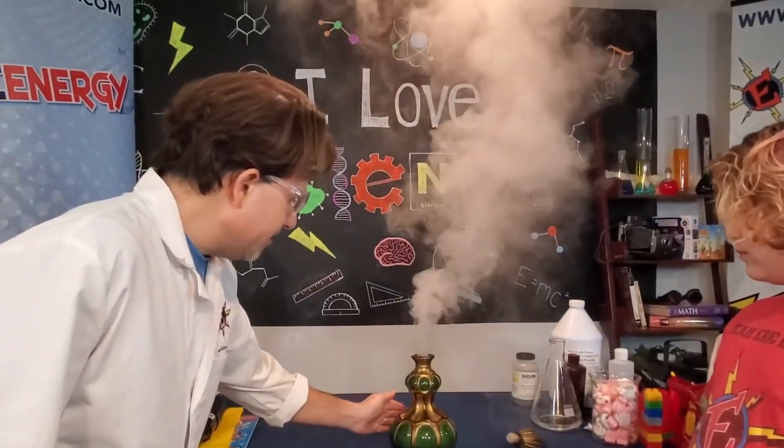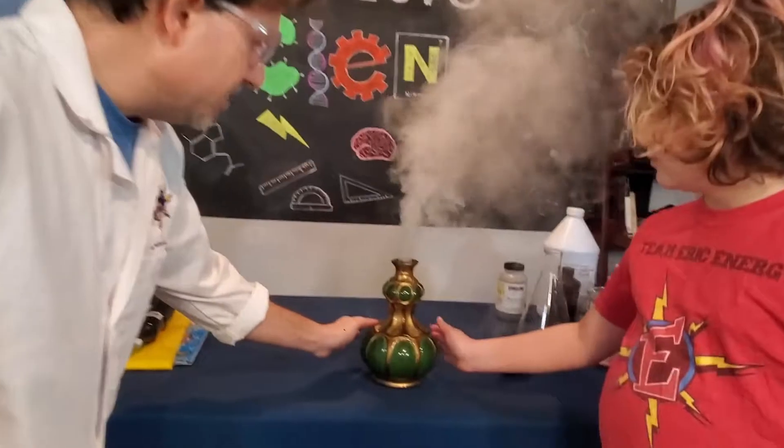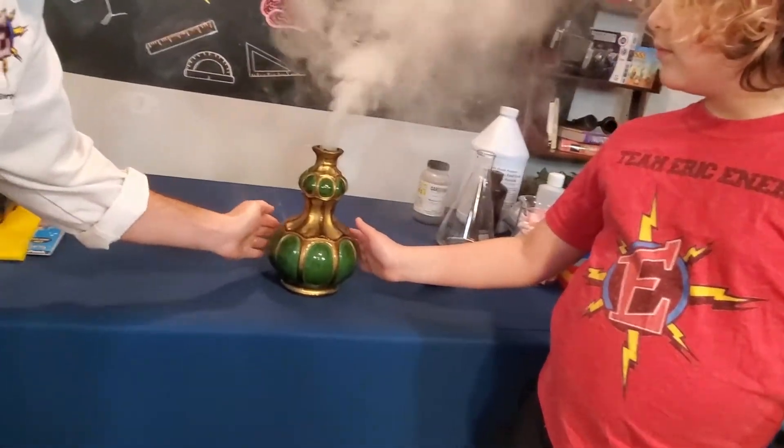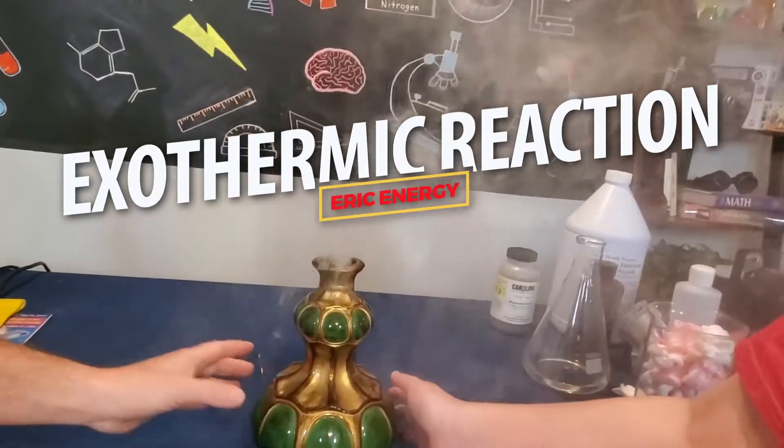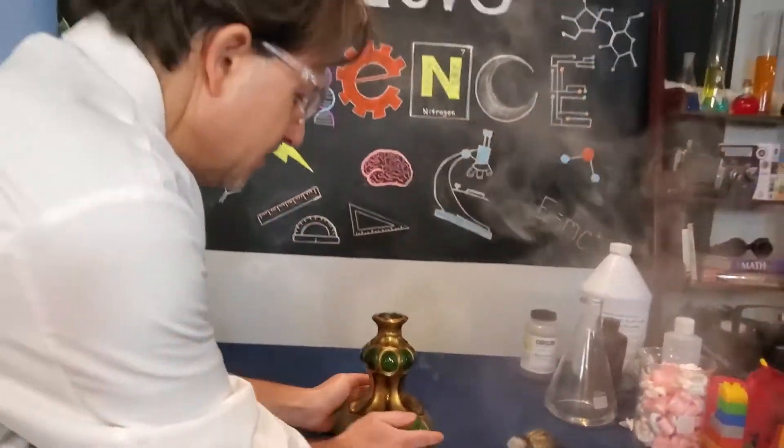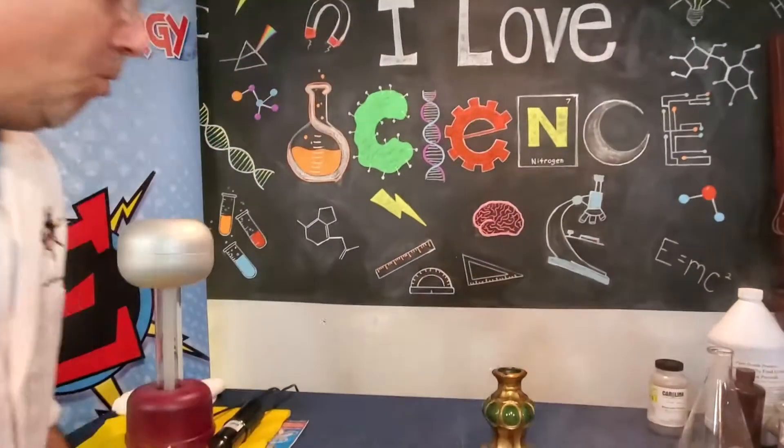Lightning, leave. I take a feel, take a really light touch of this. You can see that this is already really hot because this is what's called an exothermic reaction. It's creating heat. This is really a lot warmer than it was.